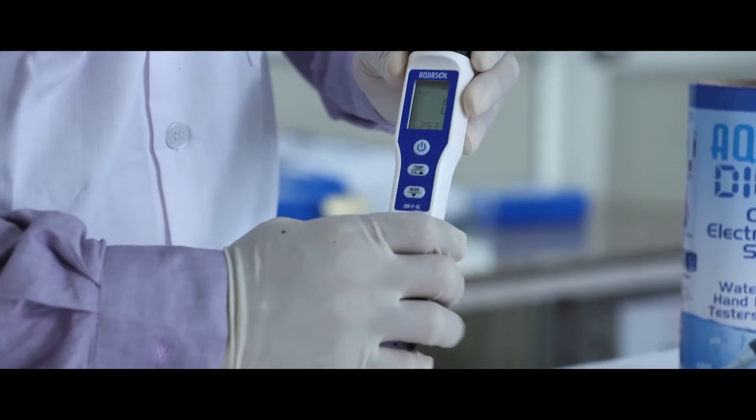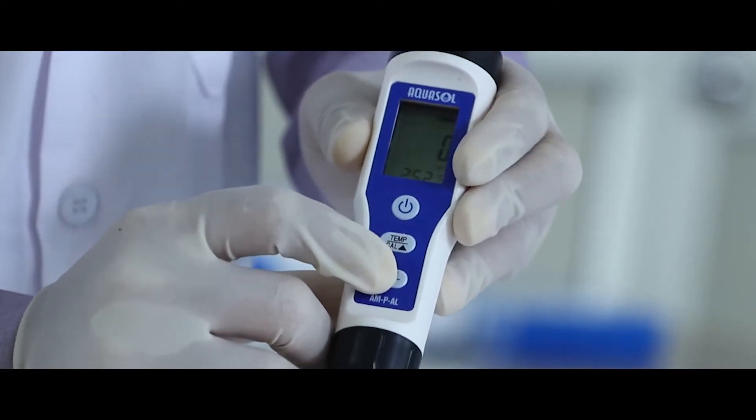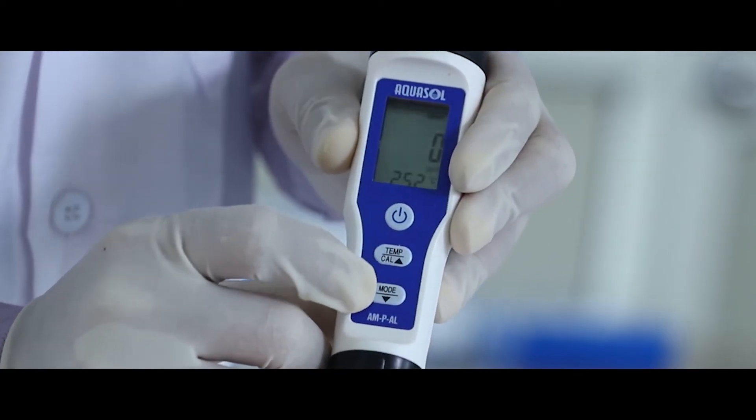Press power button to switch on the meter. Press mode key to change the modes from pH, conductivity and TDS.